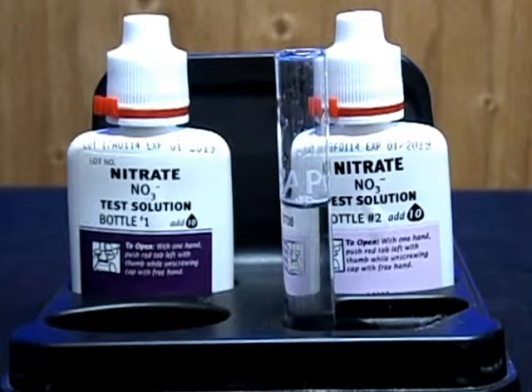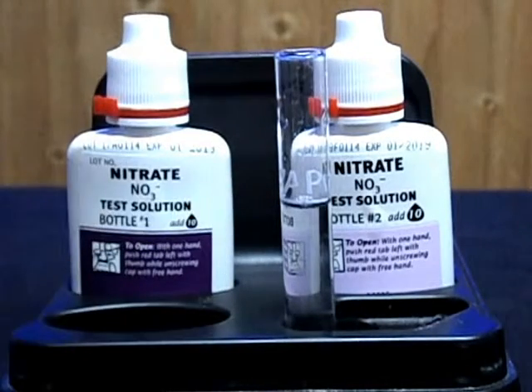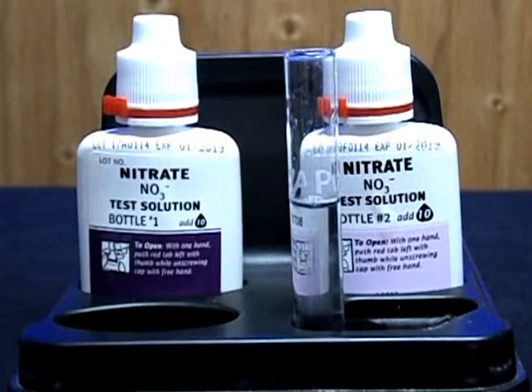Step one: you want to fill up this test tube with your aquarium water right to this line here, and that's the five milliliter mark. Step two: you want to add ten drops of bottle number one.